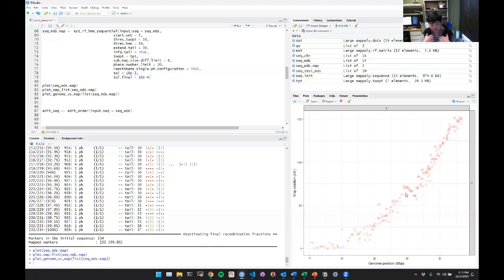So that leads me to believe that the reference genome that was made here has this, and that it is real, if I see it in so many mapping populations. And if you look at the 2 Old Blush reference genomes, they actually sequenced 2 doubled haploids that come from the same source, and the other reference genome doesn't have this inversion.